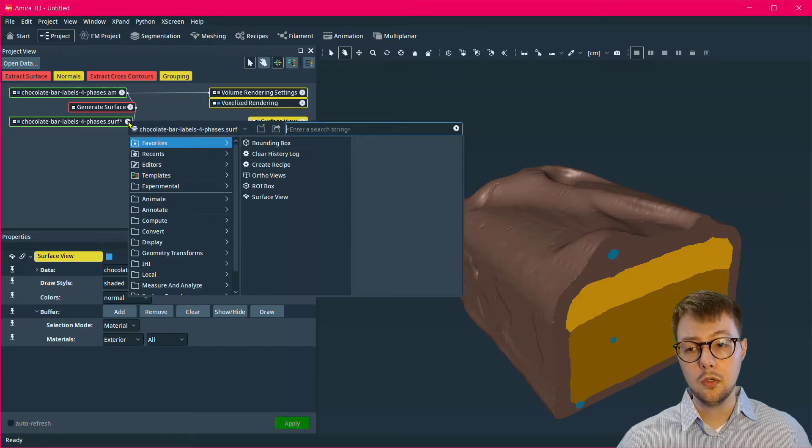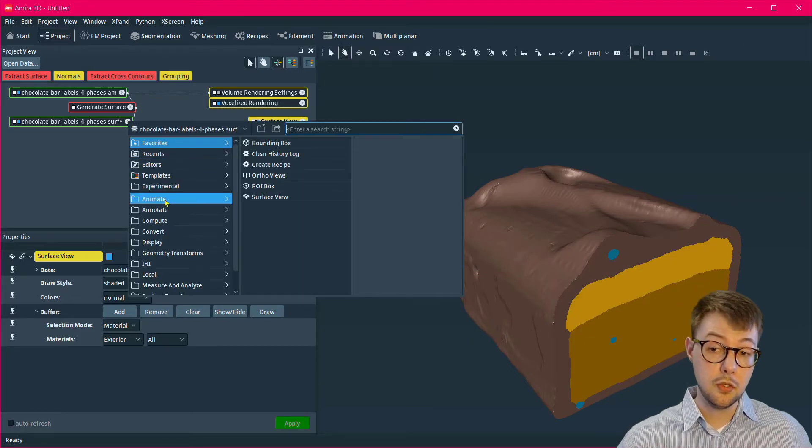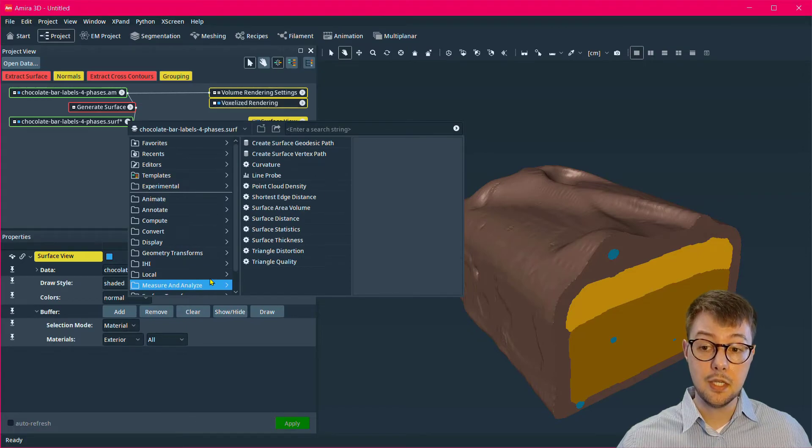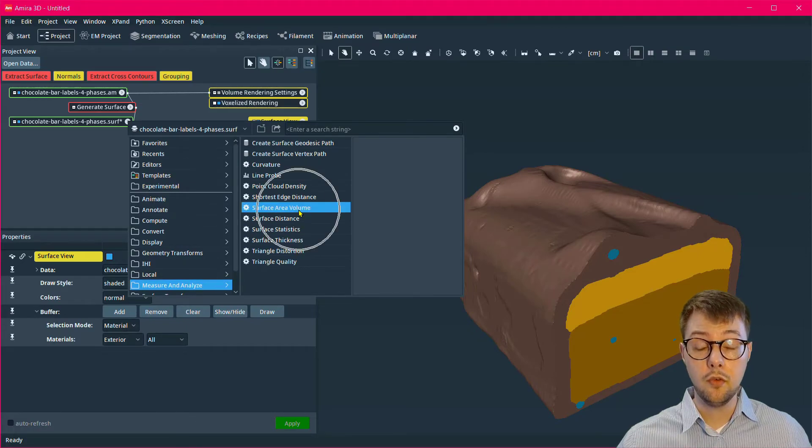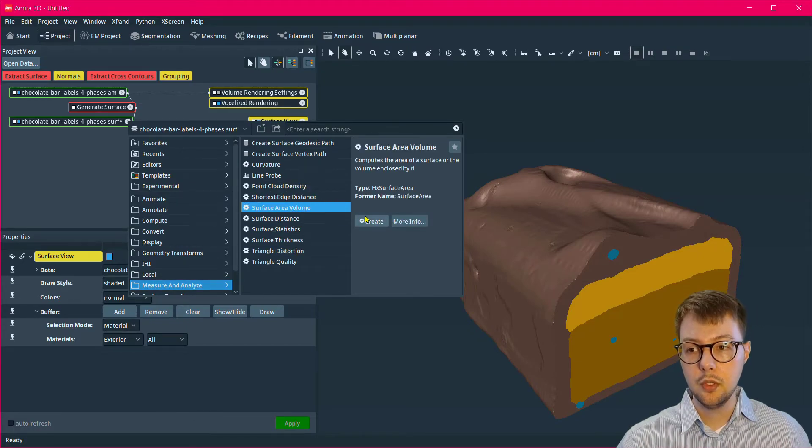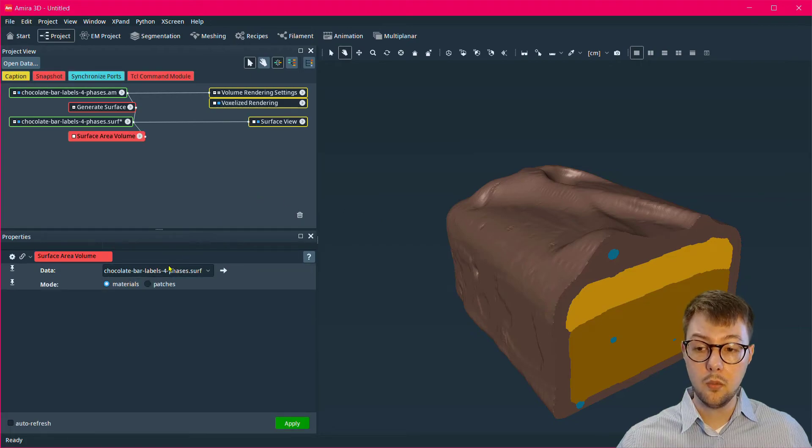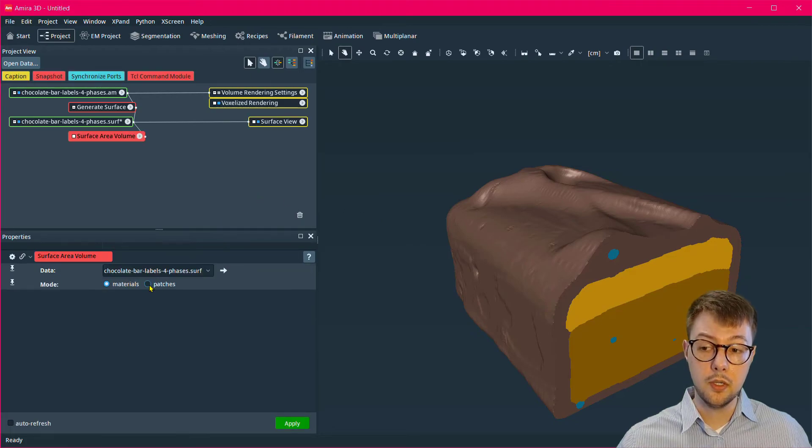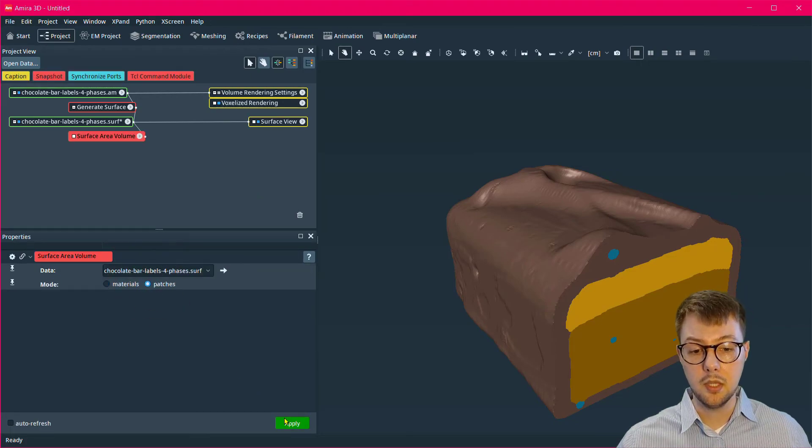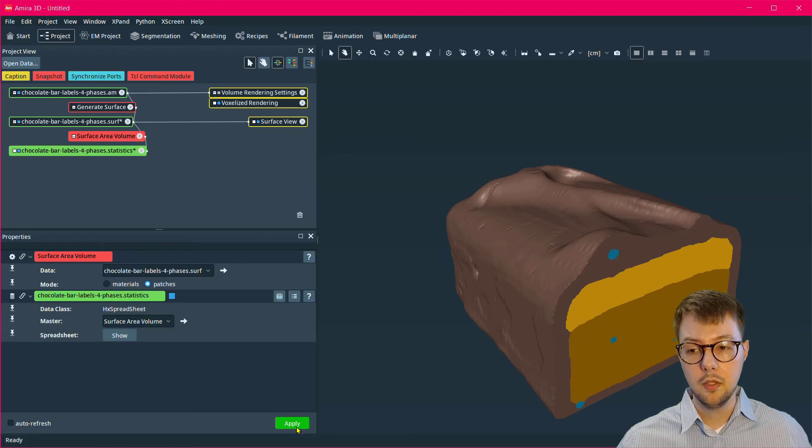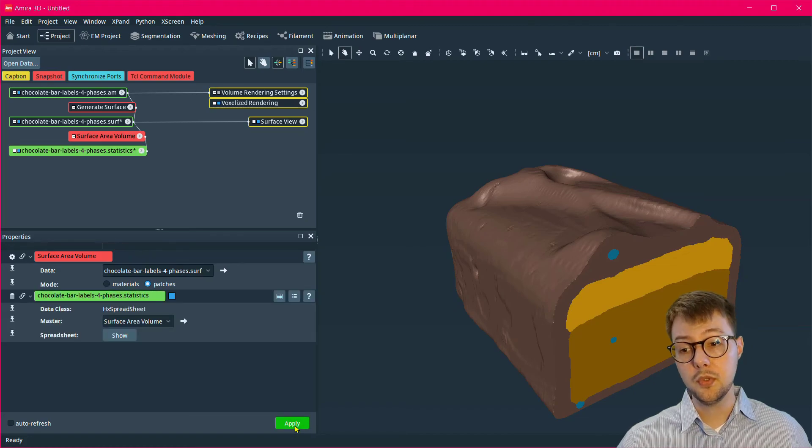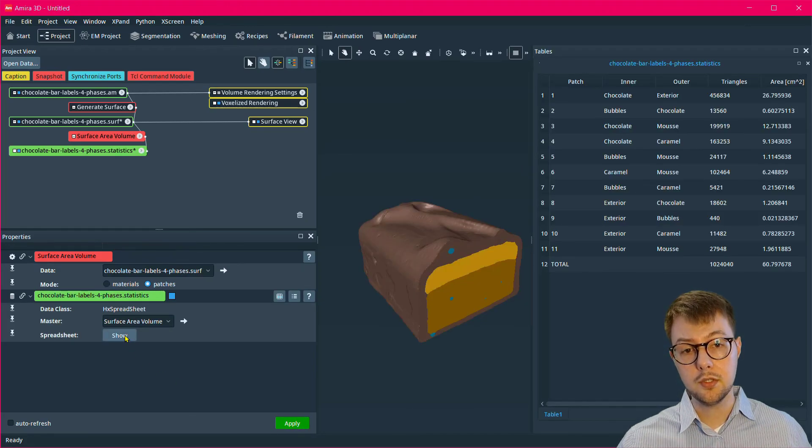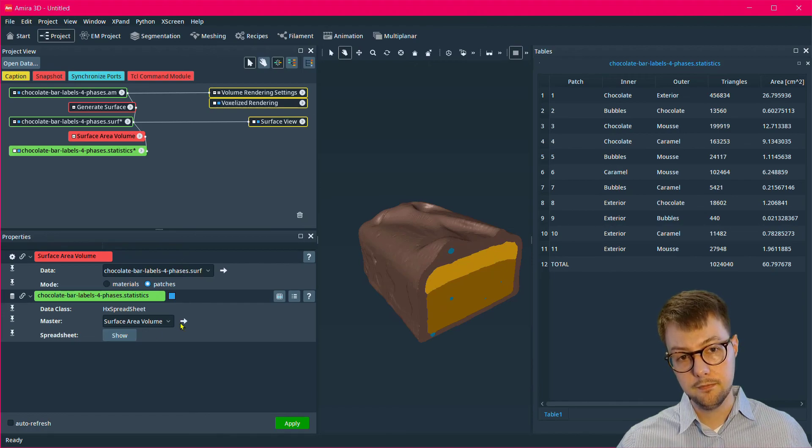In order to calculate the surface area, I attach a surface area volume module to the surface data and then decide whether I want to run it in materials or patches mode and then click apply. The output statistics spreadsheet shows the area in square centimeters.